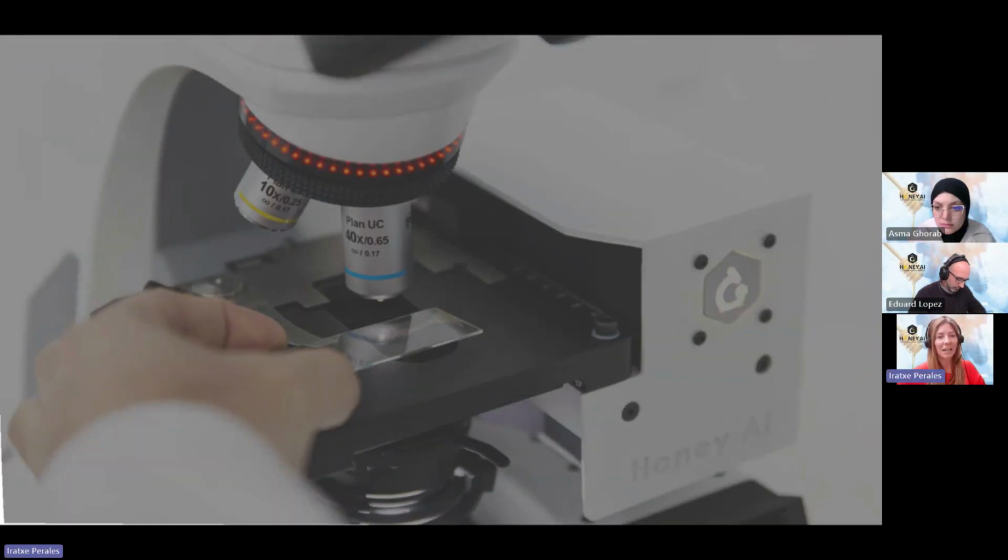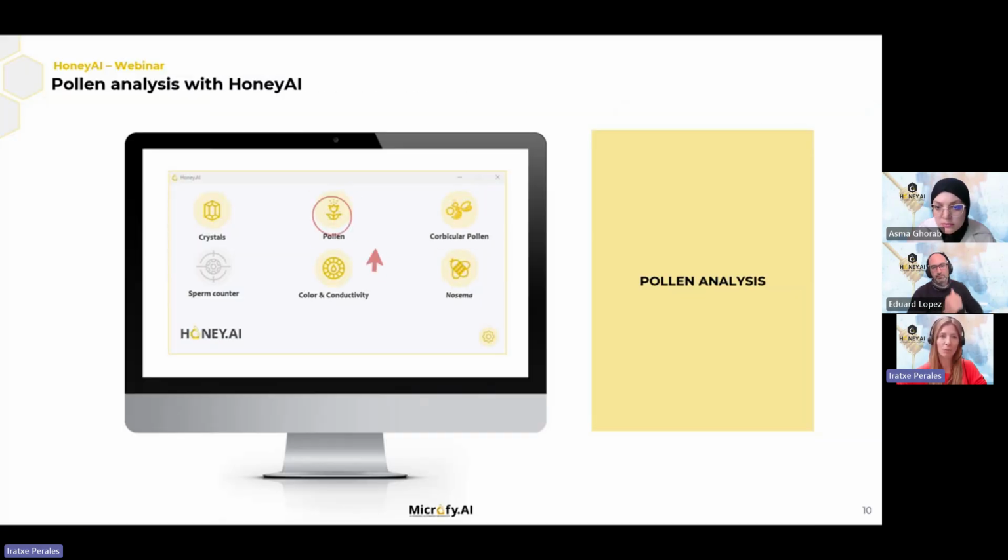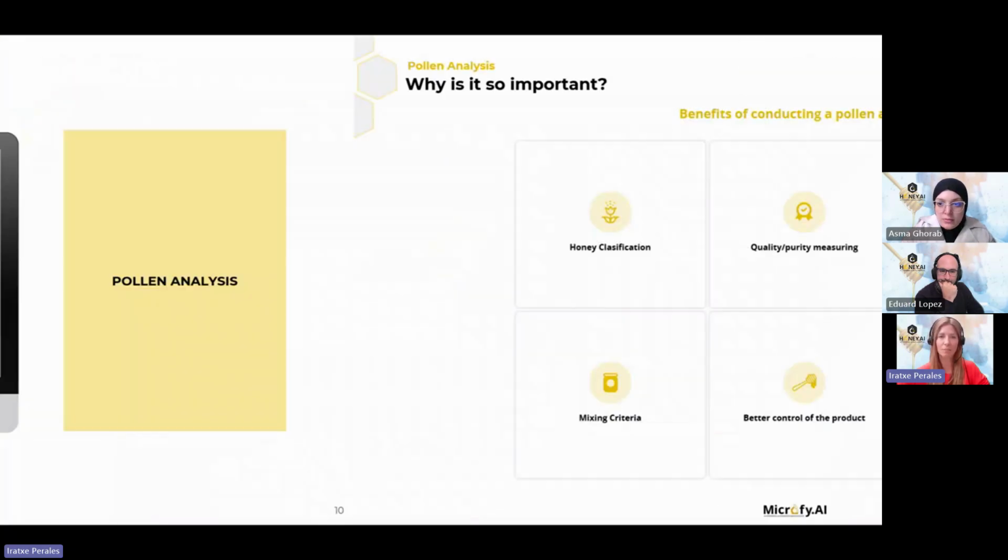Well, let's go directly to pollen analysis. We will explain everything and we will do the live demo. This is the main interface of our app. So now we will explain about pollen analysis.